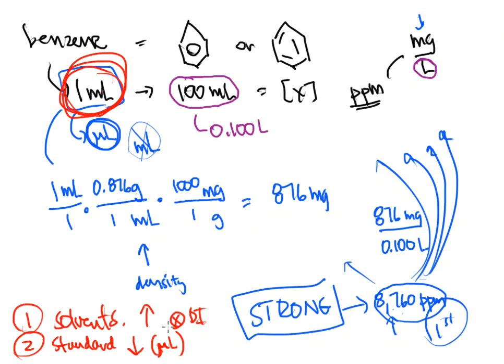Again, don't be surprised if you get vials or containers of prepped, ready-to-go standards that you just snap, like the gentleman did in the video, and then you transfer that over to a container, and you can use that to make your standards with. The microliter volumes here are typically done with a Hamilton syringe, or they can also be done with a micropipetter. So that's up to you on what you want to use. Hamilton syringes are typically the go-to in this field, but micropipetters, if you feel comfortable with those and they're calibrated, you're more than welcome to use them.